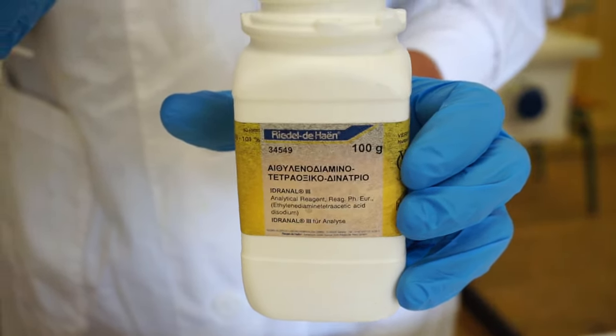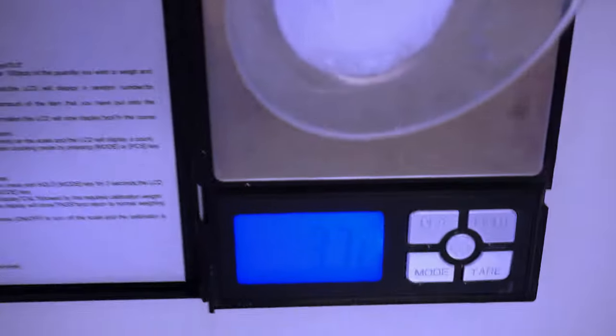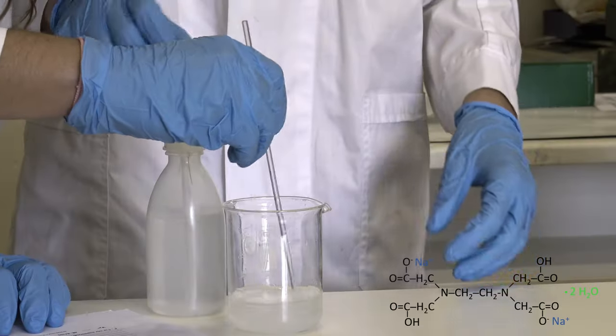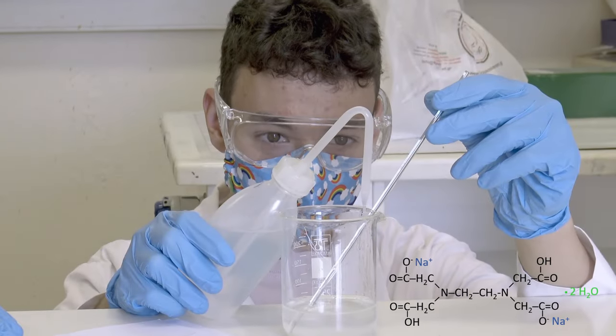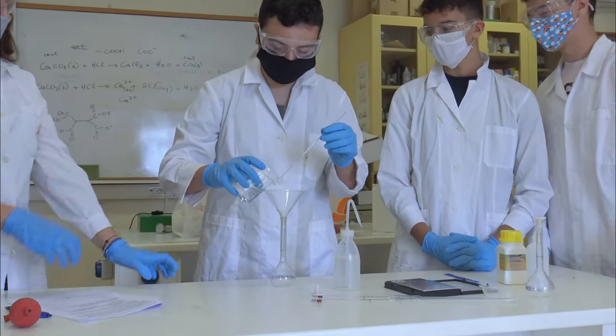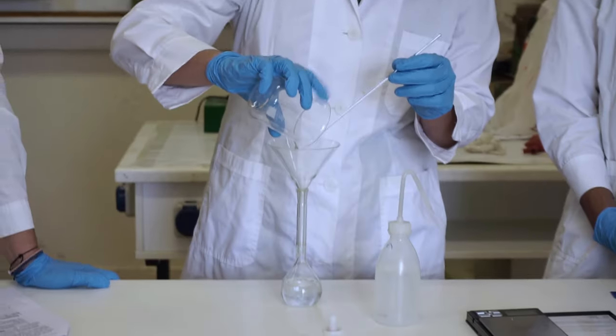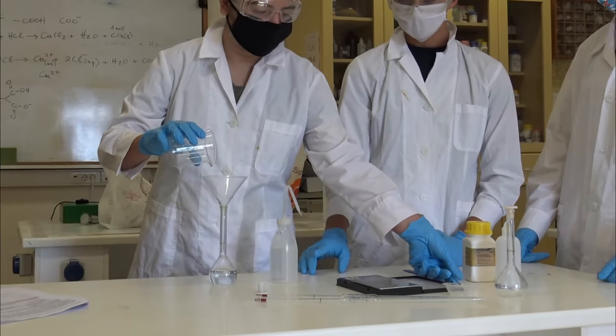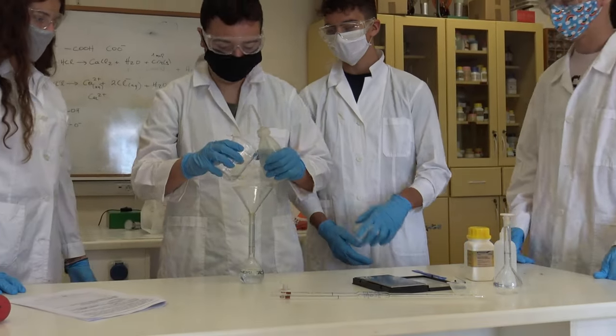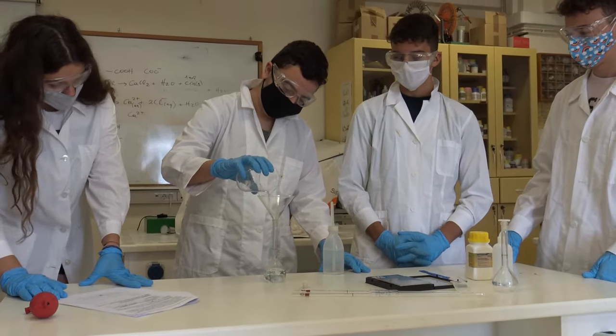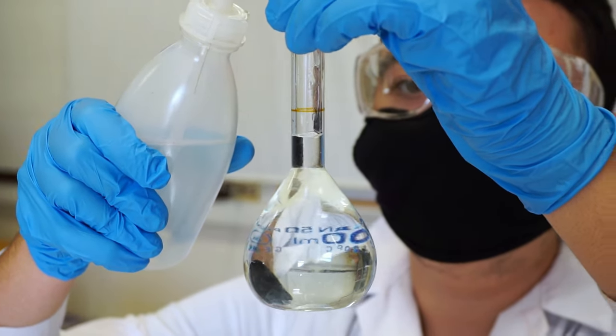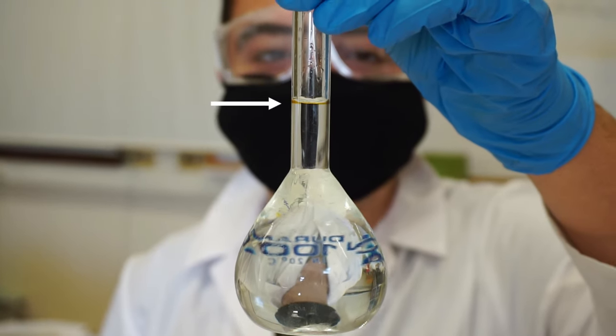First we prepare 100 ml of a 0.1 molar EDTA solution. EDTA is a chelating agent, i.e., a chemical compound that binds tightly to metal ions. We use the ethylenediaminetetraacetic acid disodium salt. Students do their best to avoid EDTA losses. The center of the concave meniscus should be exactly on the 100 ml line at eye level.